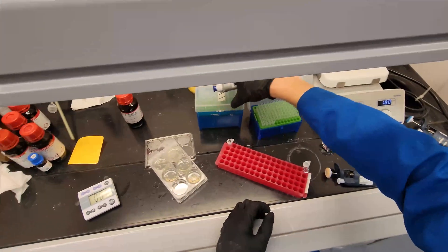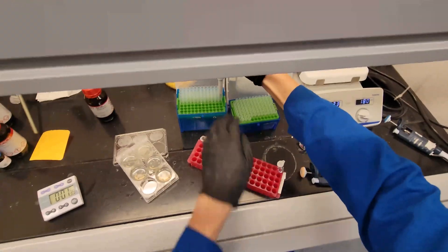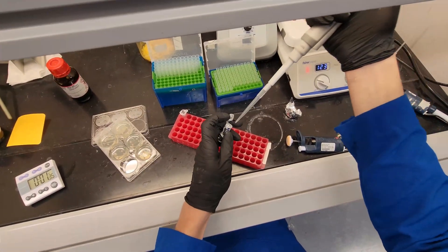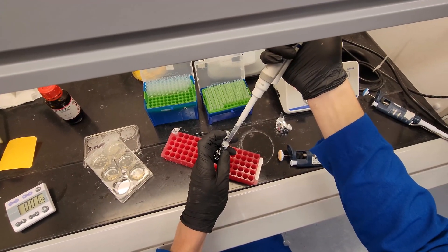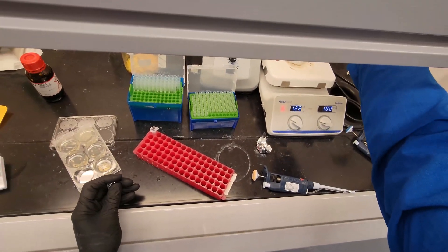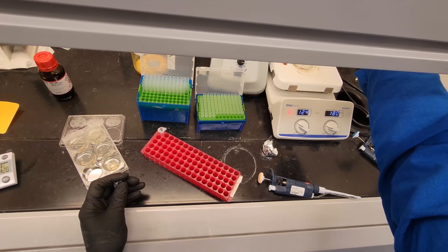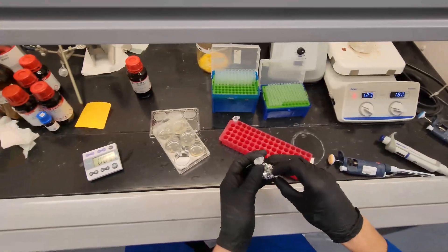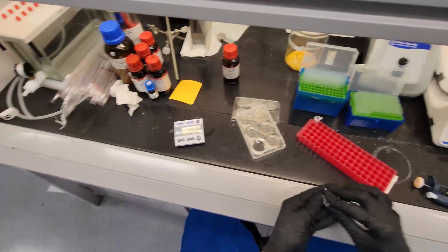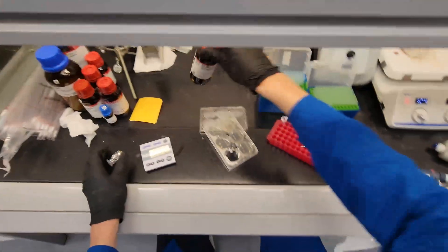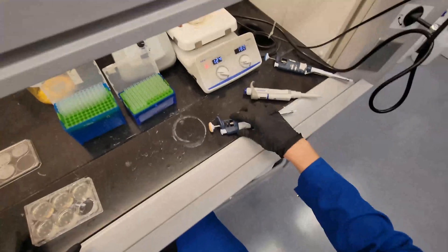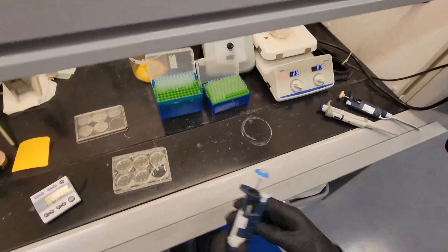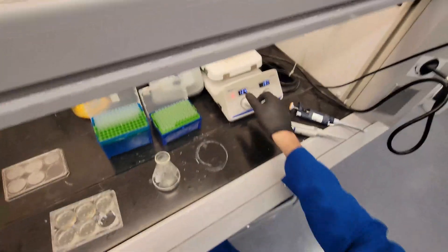That's the mercaptoethanol. And the DTT, 175 microliters. Add that. And this DTT solution can store in the minus 20 freezer for a week, maybe two weeks. But I'm not going to be using it anytime soon, so I'm just going to throw it away. I'll put the mercaptoethanol away. But the 15 minutes of chloroform is genuinely really important. If you do less than that, it won't work. Ask me how I know.